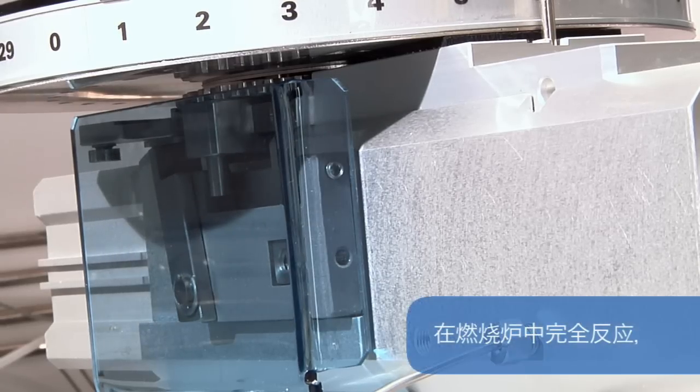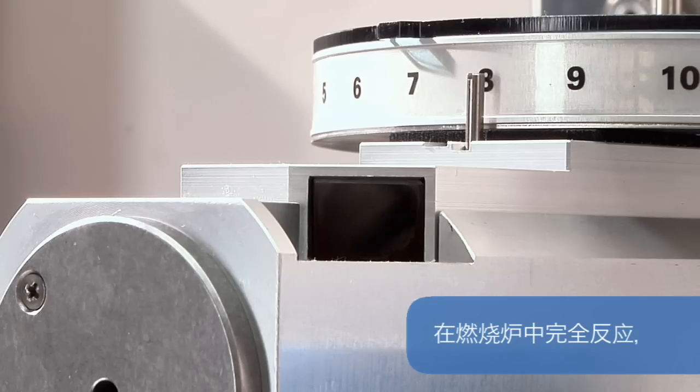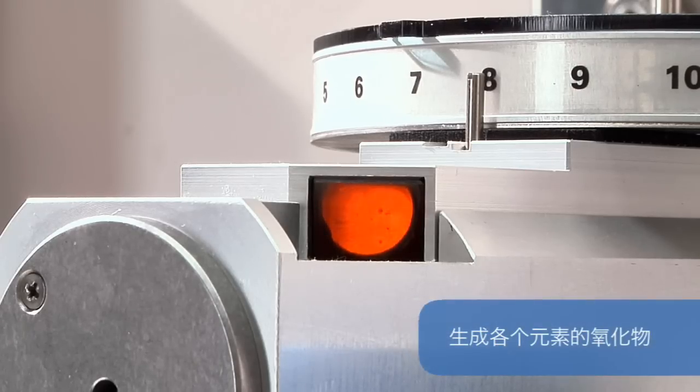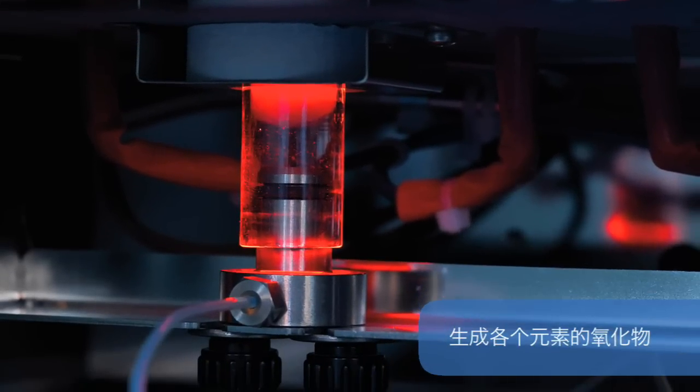The combustion reactor, filled with catalysts and in the presence of pure oxygen, ensures complete combustion. During the combustion at 1,030 degrees centigrade, the sample is decomposed into its elemental compounds such as carbon dioxide, water, and several nitrogen oxides.